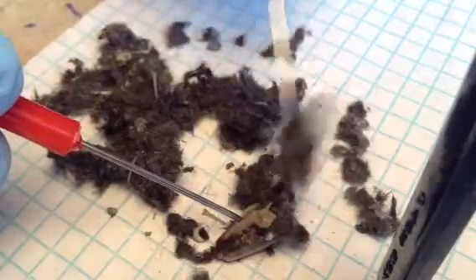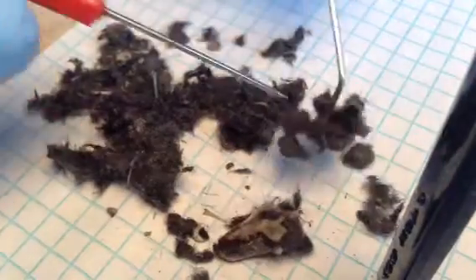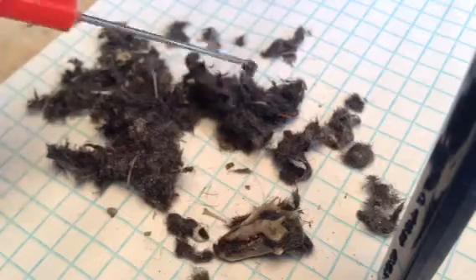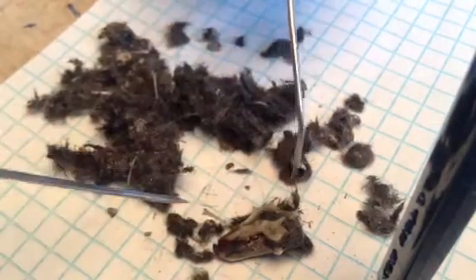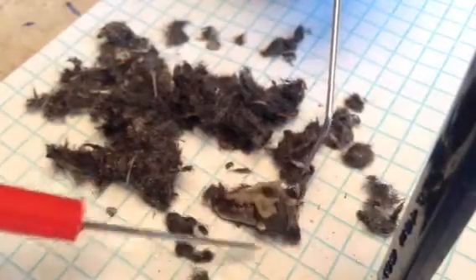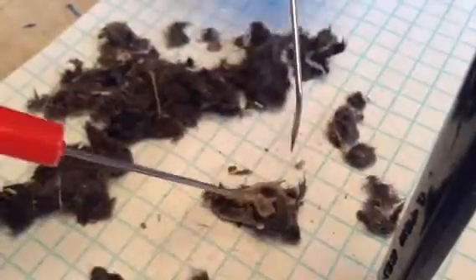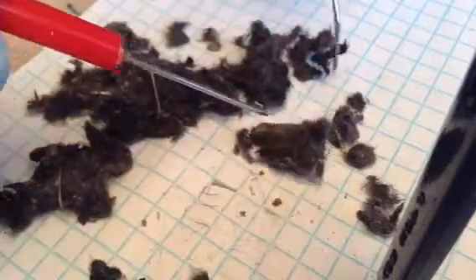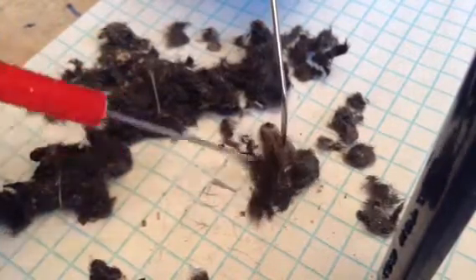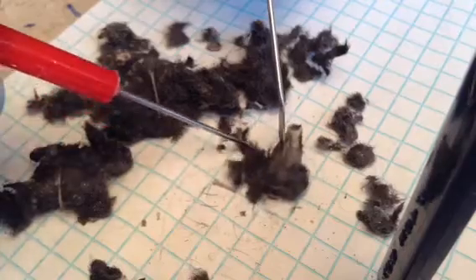Oh wow, that's really slick. I don't know if we can look on the screen and see if they can see it — it's a little towards the bottom of the screen. Oh wow, it's a complete skull with all the jaws still intact.